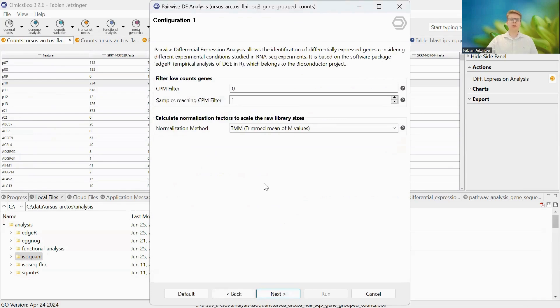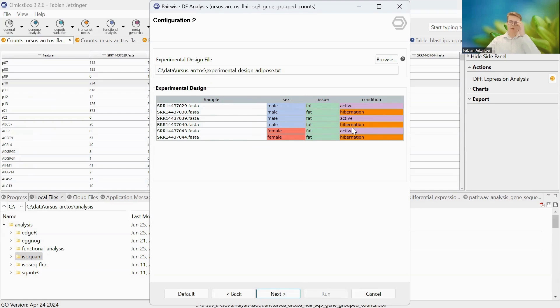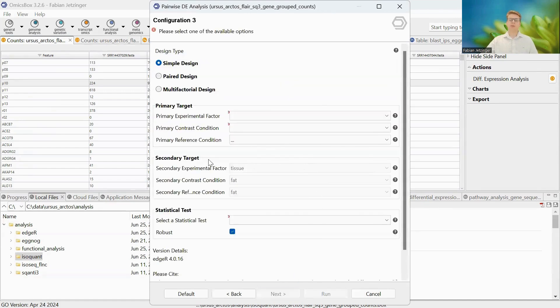On the next page of the wizard we can filter lowly expressed genes or transcripts. By default, this filters out any features showing zero expression across all samples, which is fine for our purposes. Next, we supply our experimental design via a simple text file I've prepared. Each of our six samples is mapped to the condition, sex, tissue — today we're only looking at adipose tissue — and the condition column, either active or hibernation, is the one we'll be testing.